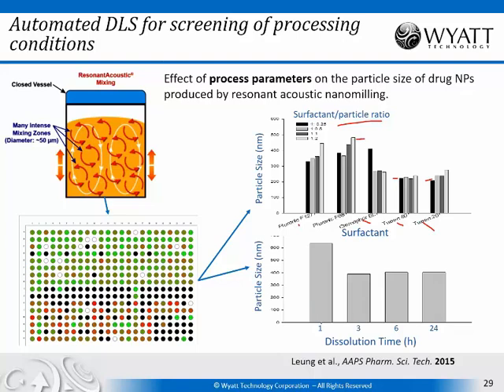And you can see that after 1 hour, there were not sufficient results, but after 3 hours, they in fact got the right size, and there was no need to go on to 6 or 24 hours, where there was no change in the effective size.